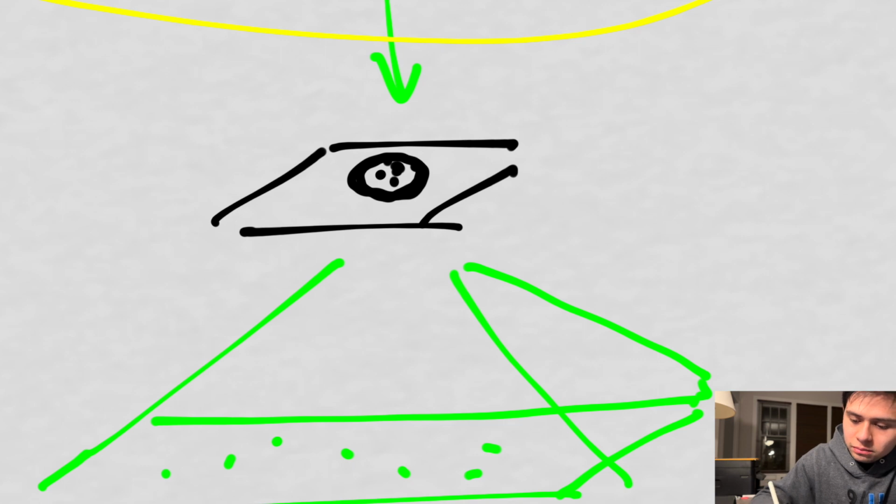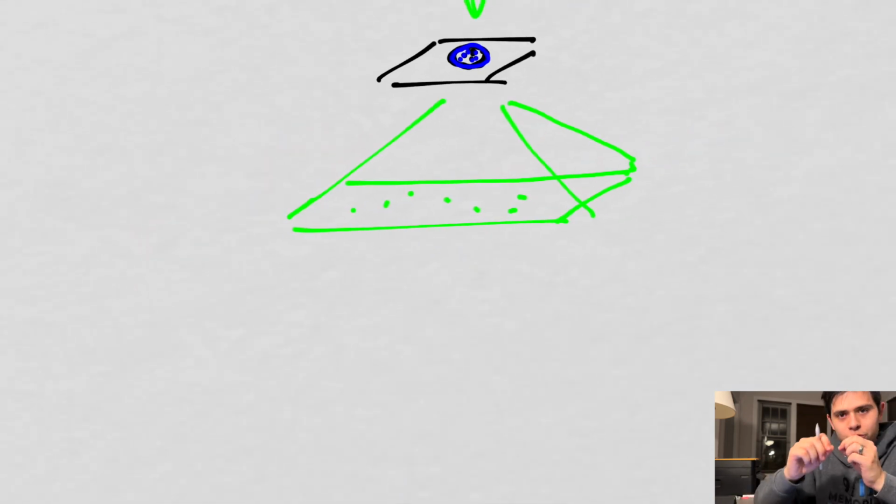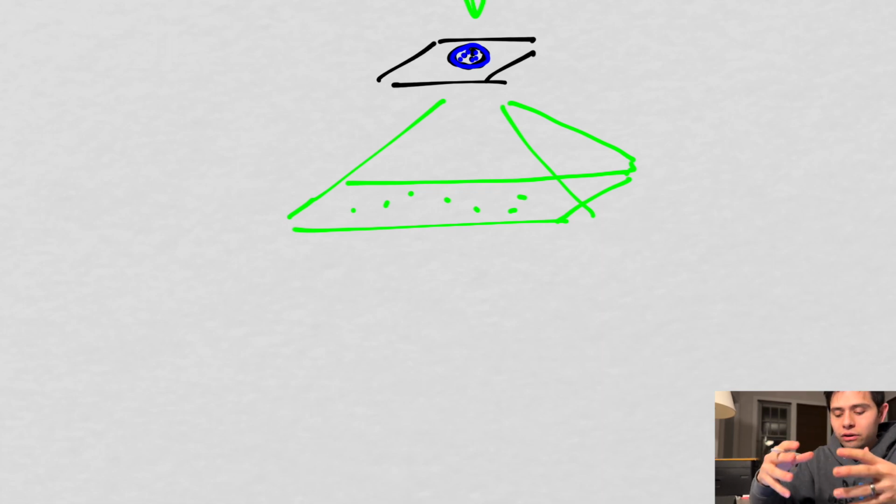And that probability wave, so what you do is you freeze this sample right here, right? So I'll do this in blue. This sample here, you have tons and tons of sample, right? So this is a little grid that contains a lot of protein, right? Each protein has a slightly different orientation to it. And because each one has a slightly different orientation, each one produces its own little unique thumbprint pattern within the projected wave that it came in contact with.